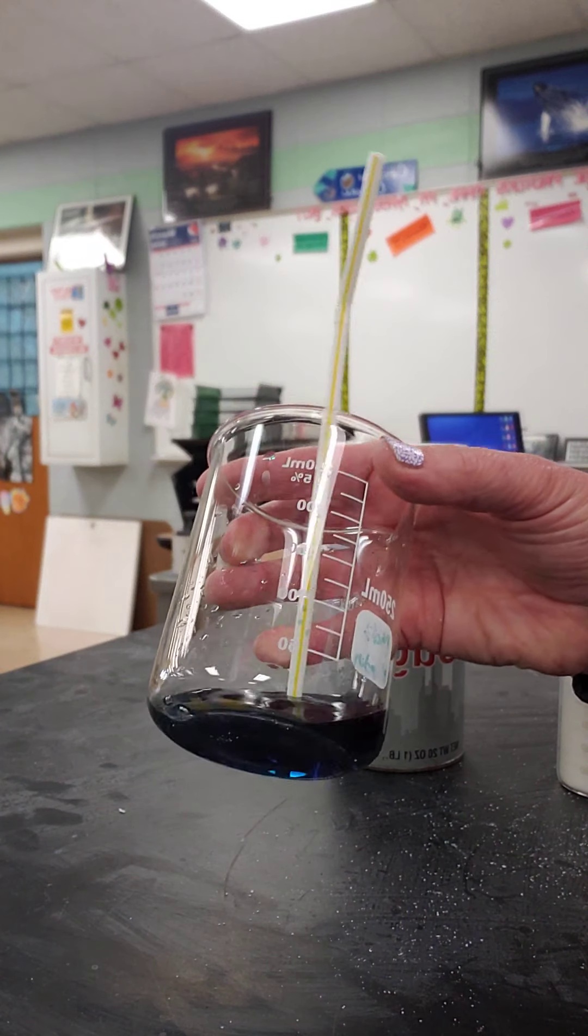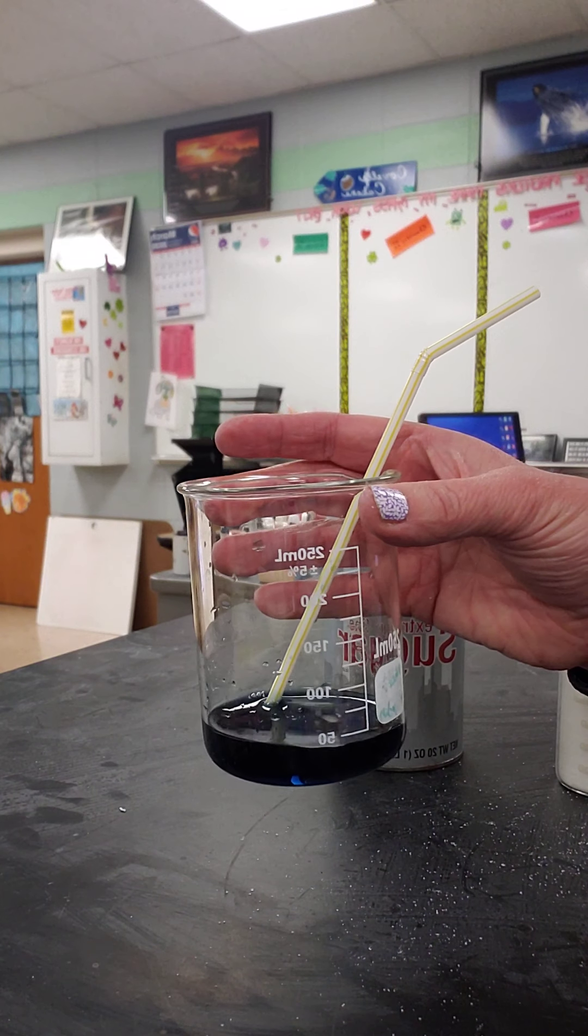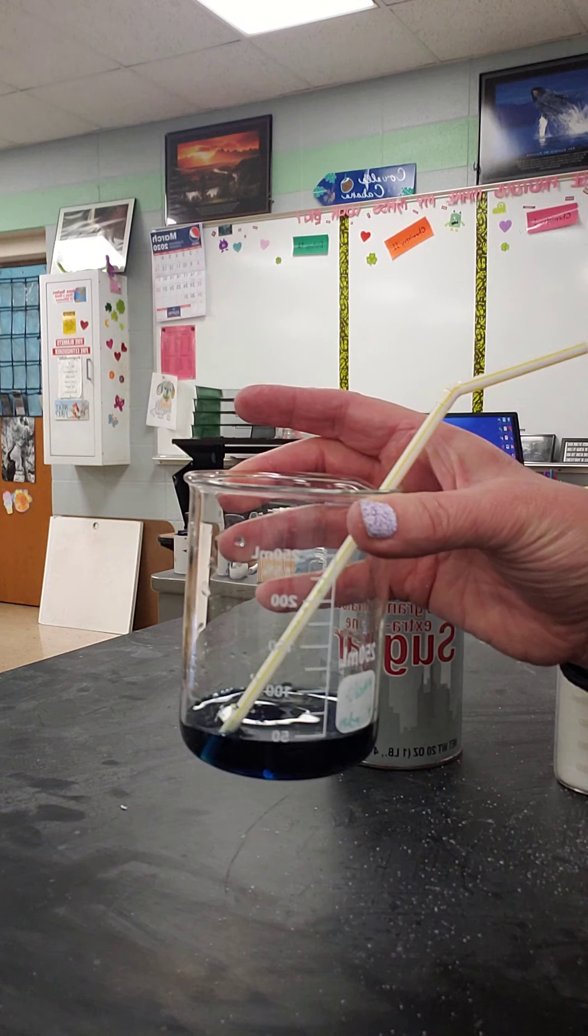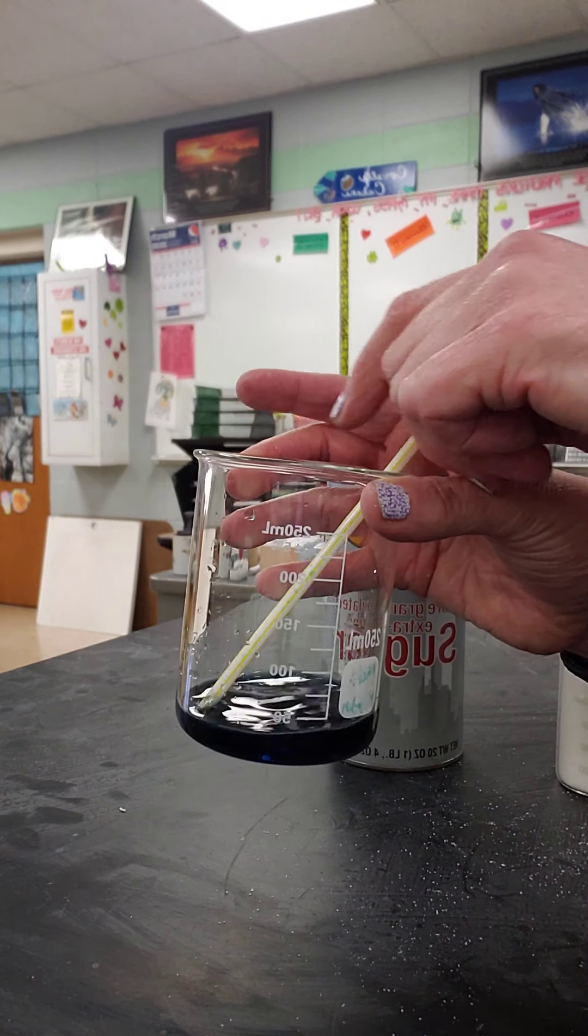BTB is an indicator. You can see it's blue. And in the presence of carbon dioxide, BTB will turn yellow. So if I blow through the straw and I breathe out carbon dioxide, this BTB should turn yellow. Let's see.